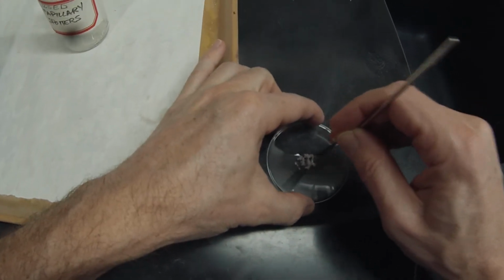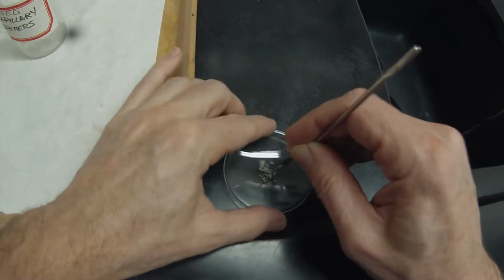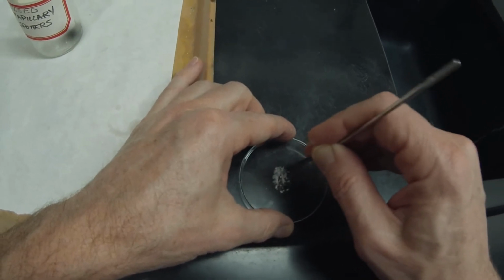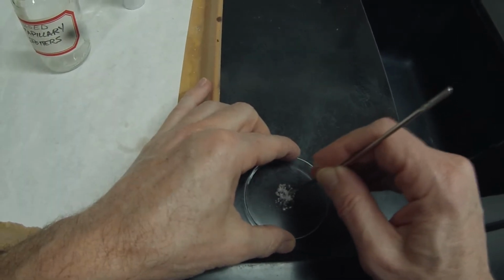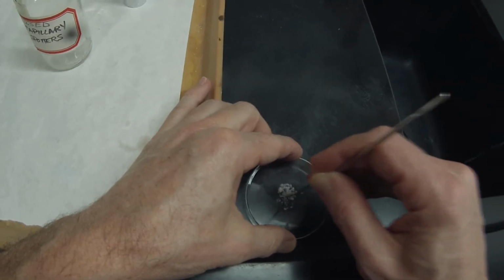I hope the camera is pointing at it and not somewhere off into the middle of nothing. I think it's there. So I'm going to break that up. I don't want these needles. I kind of want it to be powder so that it will go in a nice uniform packing into the capillary.